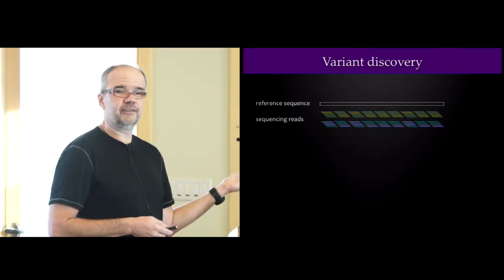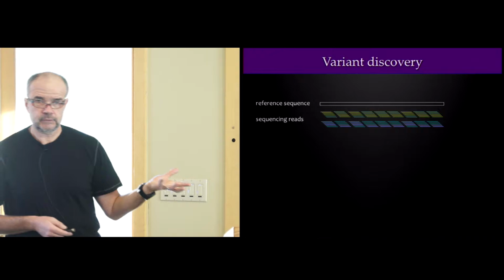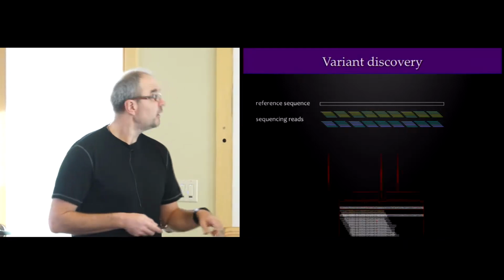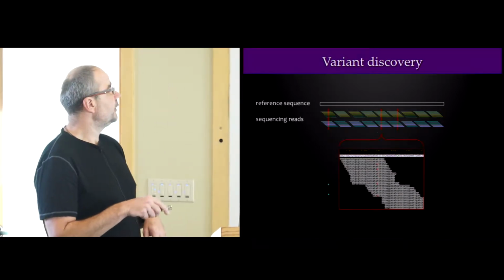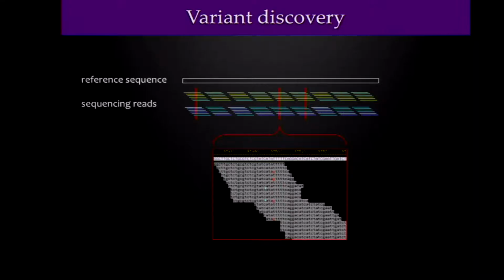Okay, so that really is what the reference sequence gives you primarily. And then, once you have that, you can go ahead and look in detail in these individuals and try to see how those sequences differ amongst them. Okay? So that's really the fundamentals.